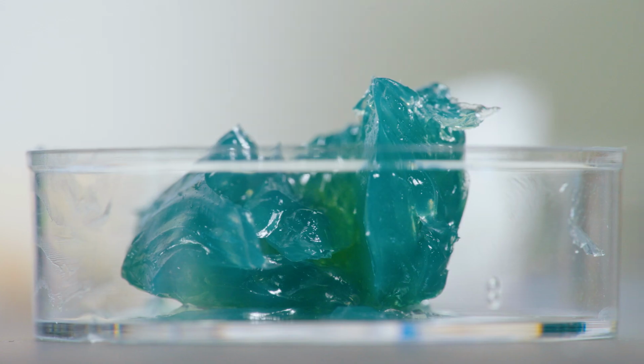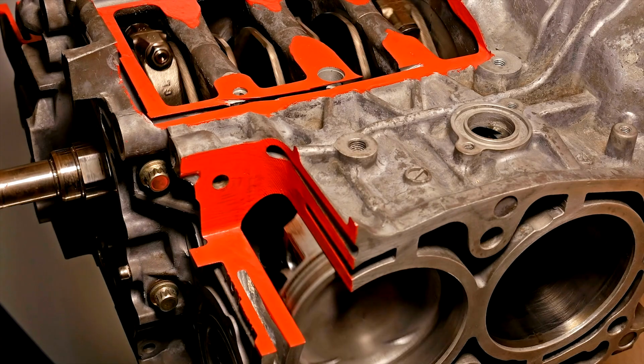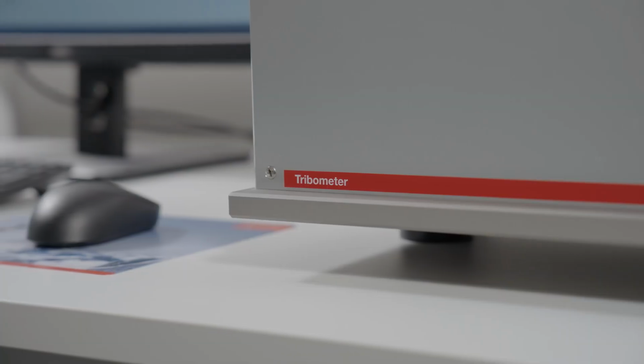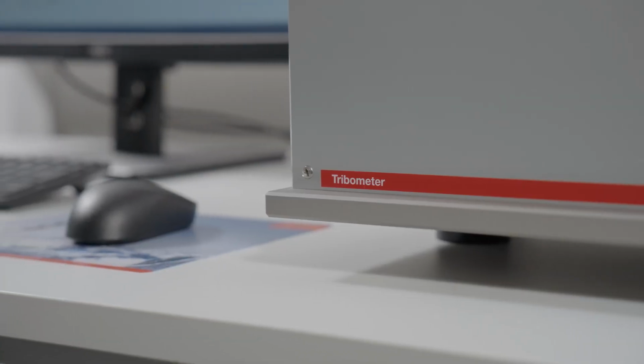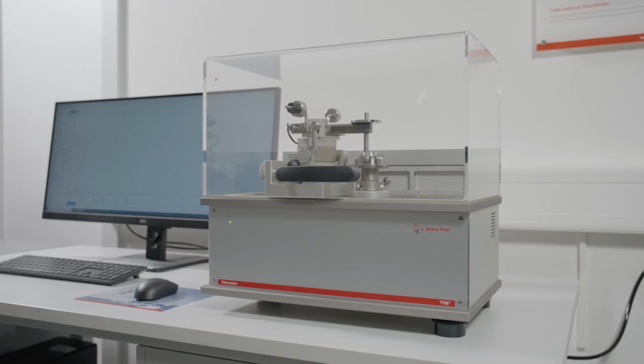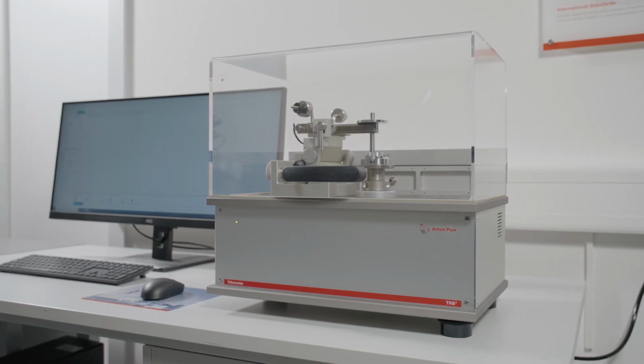However, evaluating how a lubricant performs in a real-world application isn't always easy. This is where the tribometer comes in, a specialized instrument designed to replicate real application under well-defined, controlled conditions.